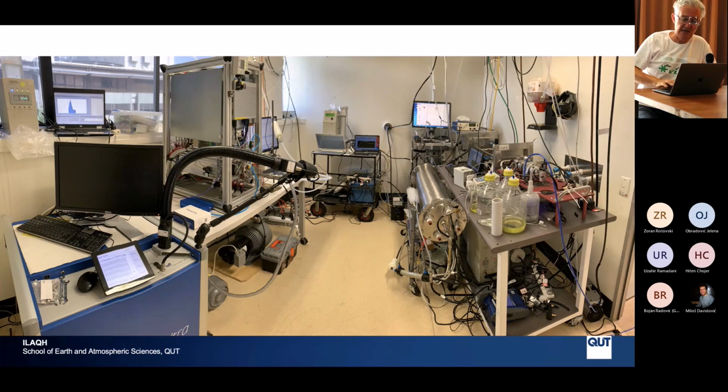So the sample goes into this flow-through reactor. And after the flow-through reactor, it goes to the aerosol mass spectrometer, which measures the composition of the aerosol versus size and total composition. It goes into a scanning mobility particle sizer to measure the size distribution. And also we had a SIFT, selective ion flow tube, like a PTR-MS.